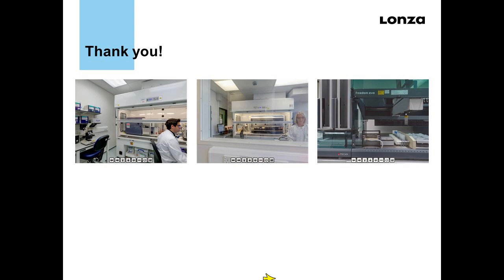However, it depends on what purpose you're using the method for. If you're using screening for high throughput, what we've done is absolutely fine. But if you want to go into something like reference standard characterization or batch release testing, then you might want to do further confirmation using things like exoglycosidases to confirm subunit confirmation and linkage confirmation.